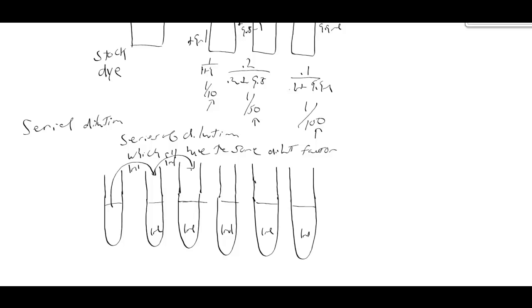And then move 1 ml from that tube to the next. We'll mix it well and move a ml to the next tube. Repeat a ml after we mix it, and then finally here we'll move a ml from there. So this is a serial dilution. Each one is diluted from the previous dilution into the next one. So we're seeing this 1 ml plus 1 ml is a 1 to 2.